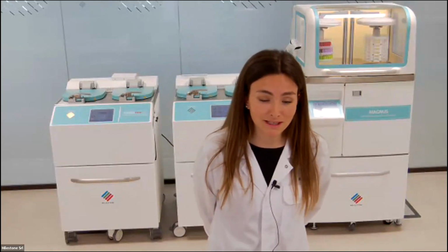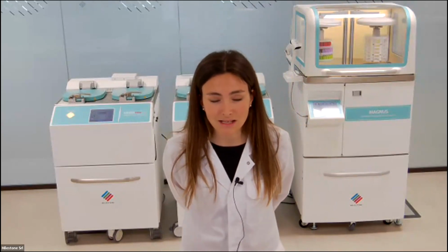I was recently in a lab that performed this operation in a few days, but regarding the tissue processing part for the super mega cassette, it takes 2 days, one for the fixation part, more or less, and one entire day for the other steps.